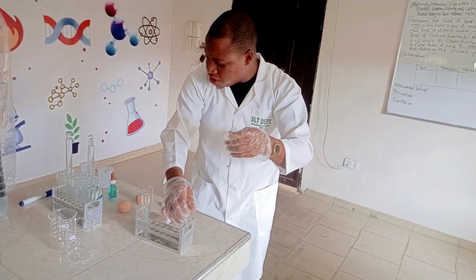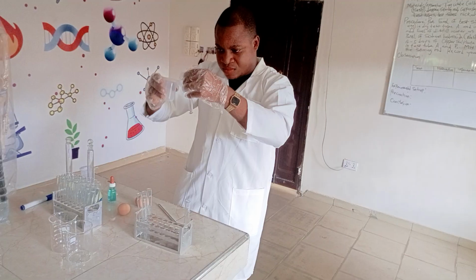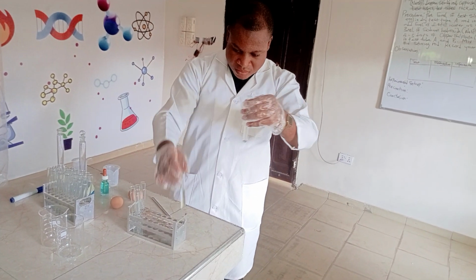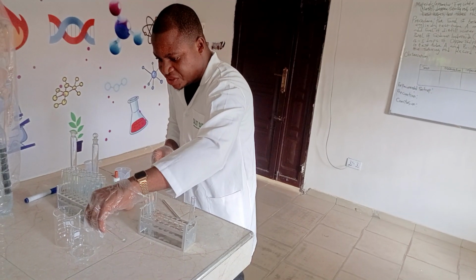Let me bring the volume to be equal. Reduce this.